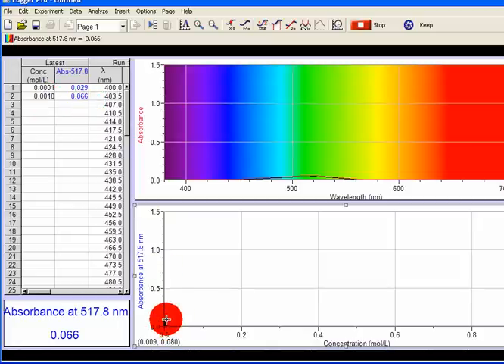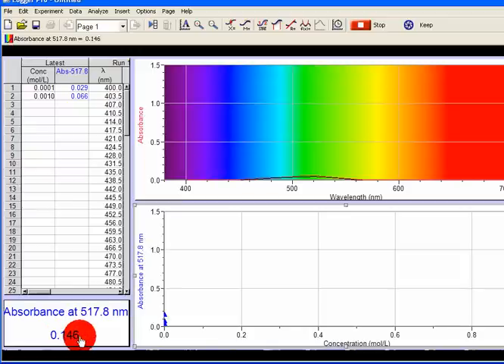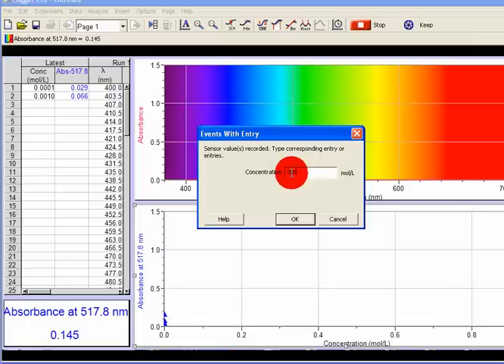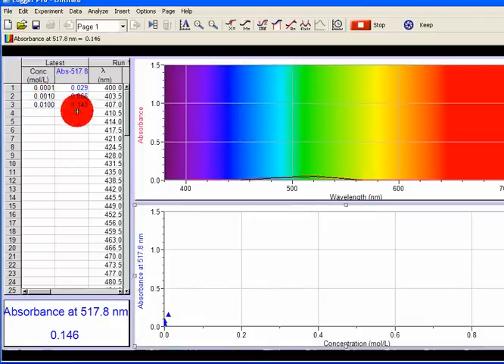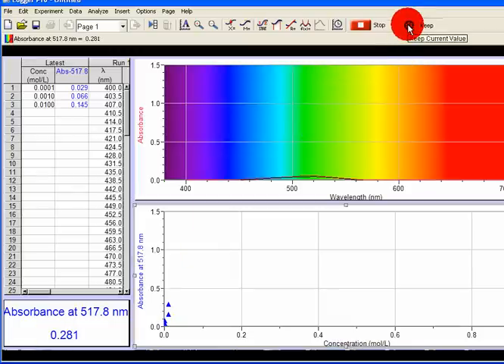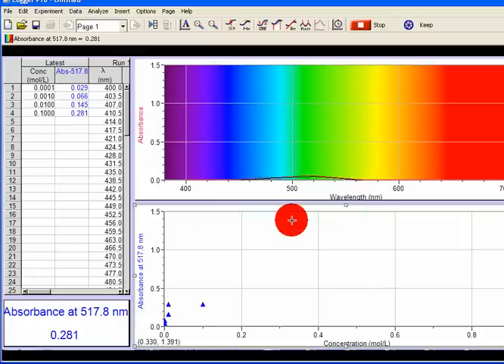Put in the next concentration. My next concentration gives an absorbance of 0.145. I'm going to press Keep. My concentration is 0.01 M. Press OK. So for 0.01 M concentration, absorbance is 0.145. Next concentration — put in my next concentration. The absorbance now is 0.283. Let it stabilize, then press Keep. Key in the concentration: 0.1 M. Press OK. So for 0.1 M, absorbance is 0.281. It shows that as concentration increases, absorbance increases.